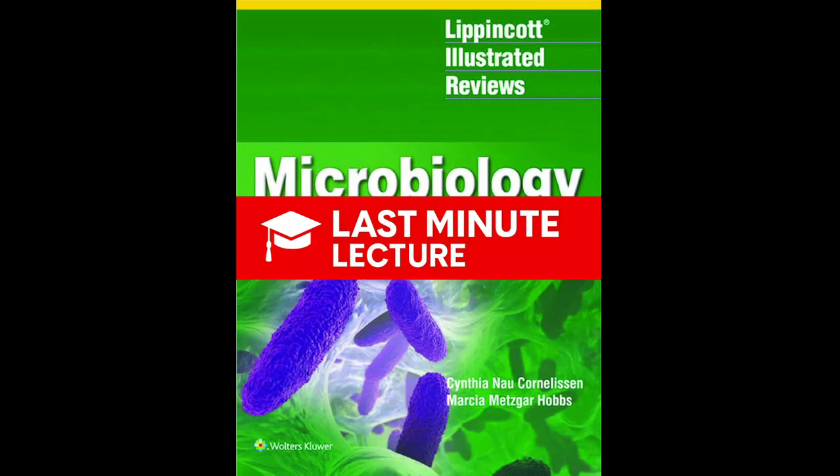If you see pink little spheres in pairs from a urethral sample, Gram-negative diplococci, that is Neisseria gonorrhoeae until proven otherwise. You can start treatment for gonorrhea right then and there. But not everything plays by the rules, right? The book lists exceptions. The weirdos, yeah. I mean, some bacteria like Mycoplasma don't even have a cell wall. You can't stain something that isn't there. And others have waxy walls, like TB. Exactly.